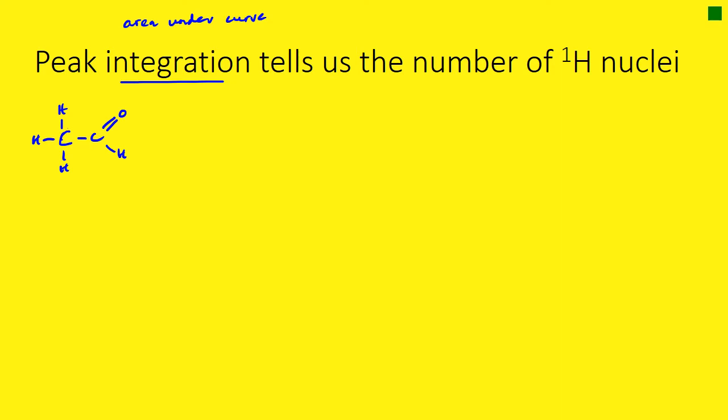And let's quickly draw our curve. So we have, let's again do it in red for this one, that one there at just less than 10, and we're going to have, let's do it in green, these 3 here. I'm going to go there, just more than 2.